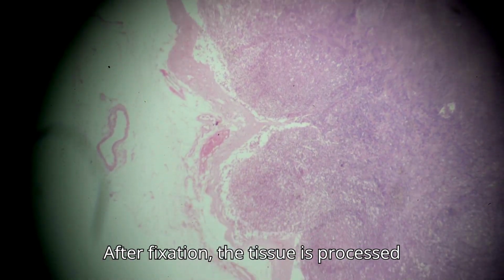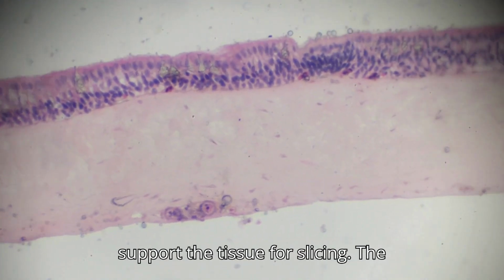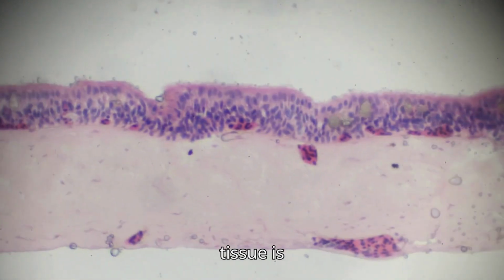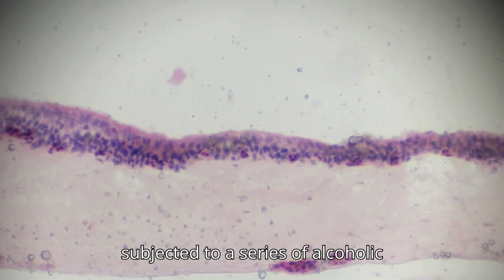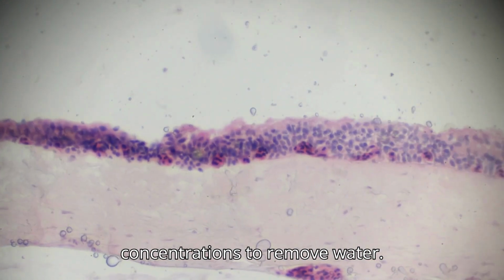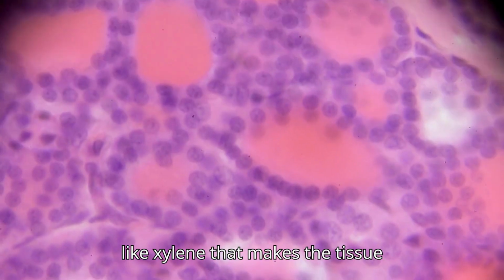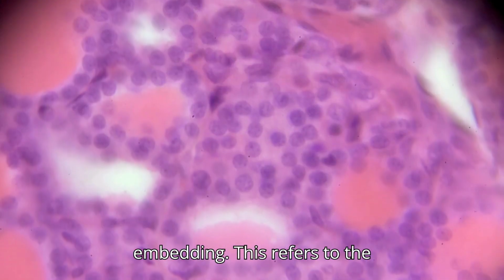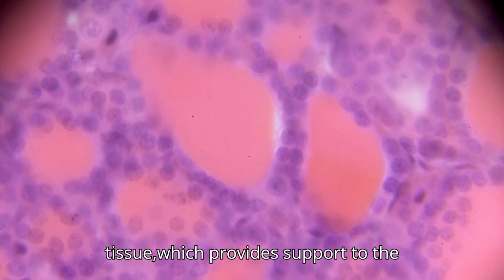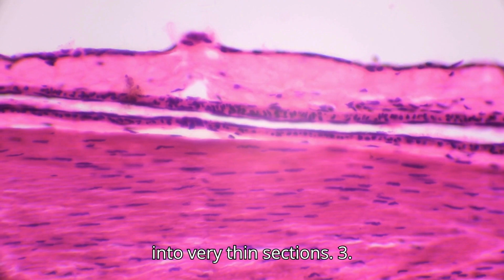2. Processing. After fixation, the tissue is processed to remove water and replace it with a medium, usually paraffin wax, that will support the tissue for slicing. This process includes dehydration. The tissue is subjected to a series of alcoholic baths with progressively higher concentrations to remove water. Clearing: alcohol is replaced with a clearing agent like xylene that makes the tissue transparent and ready for embedding. Embedding: this refers to the infiltration of paraffin wax into the tissue, which provides support to the tissue and facilitates ease in slicing into very thin sections.